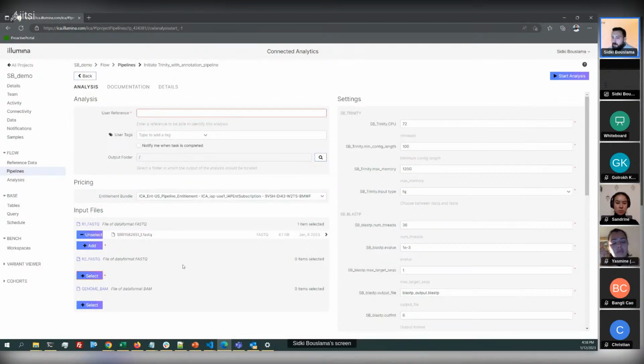But also, anything I run here, I can also just run through the command line interface or through an API. So when I need to scale up and run hundreds or thousands of analyses with the exact same pipeline, for example from a database of samples that I need to process, that can be done with a single line command, because everything that has to do with managing the infrastructure, transferring the files back and forth to the compute node, all of that is being handled by the platform.